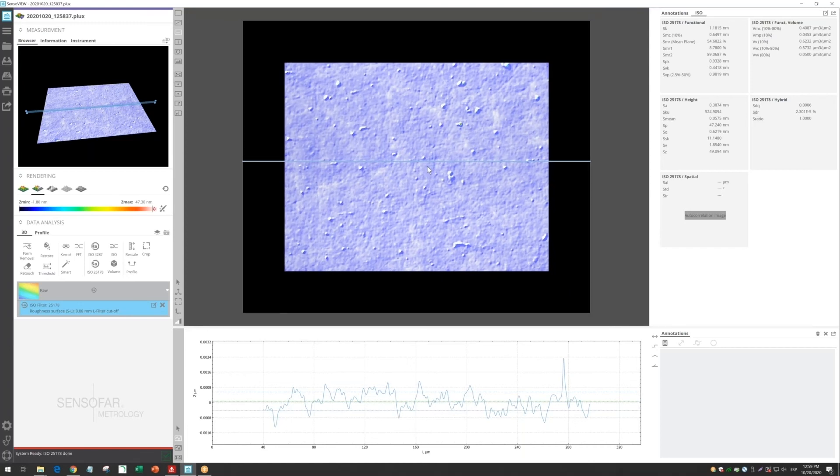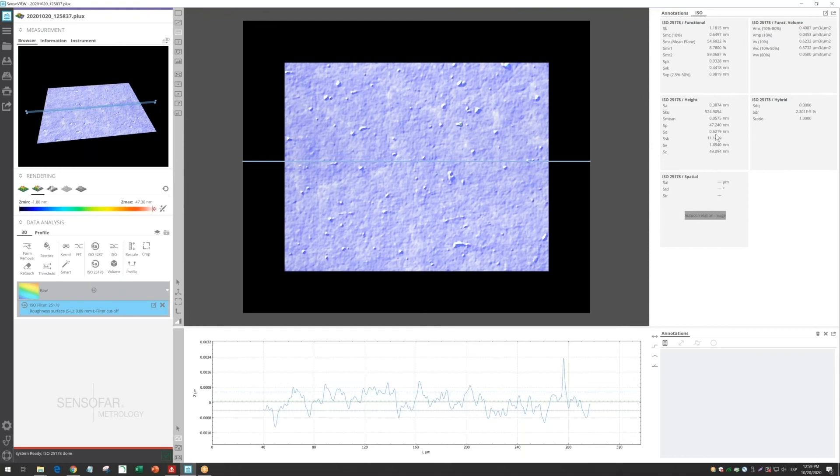For this field of view, we have applied a cutoff, a nesting index of 80 microns, and we have an SA value of 0.38 nanometers or an Sq value of 0.6 nanometers.